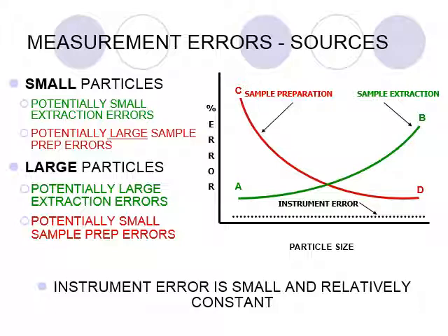Then the other portion, which probably is even more important, is that sample preparation error. Did you properly break apart and disperse your agglomerates to measure your true particle size? Did you have enough ultrasonic? Did you have consistent behavior? Was the system showing instability so that you were getting agglomerates and then coming back? Are you not mixing it well enough so that your big particles are settling out? You control all of that, and your measurement error is related to how you do these two different things.